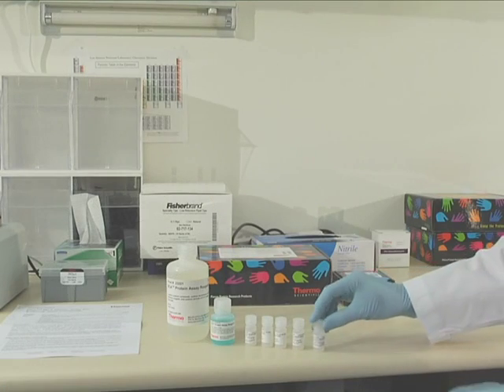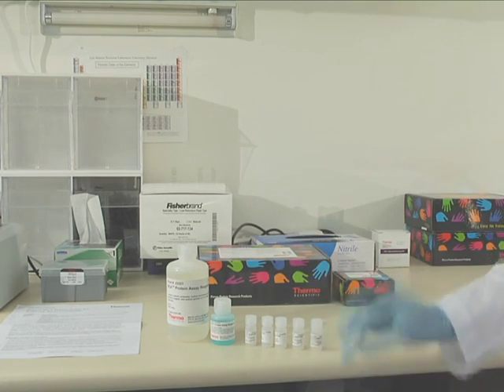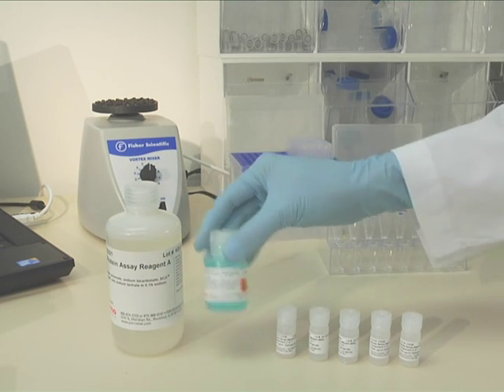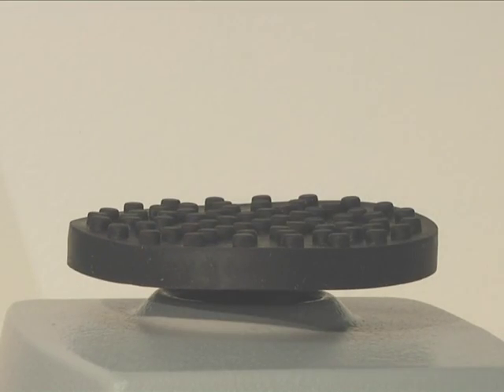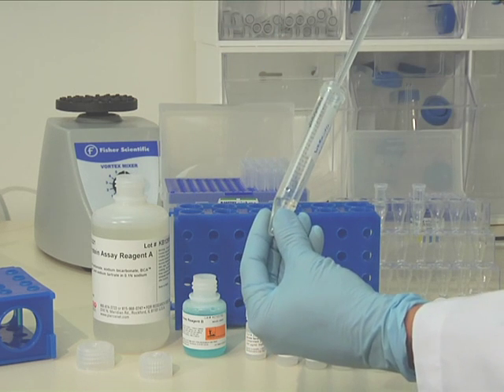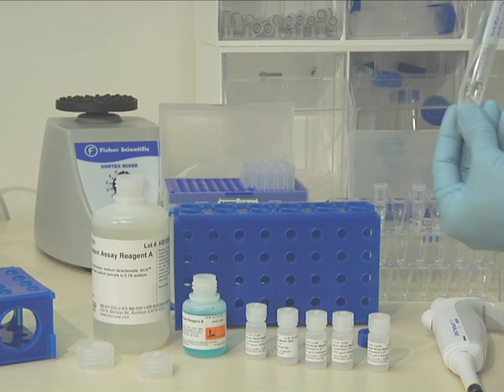To prepare the reagents, first equilibrate all unknown proteins and protein standards to room temperature and mix thoroughly by gentle vortexing. Use a mid-level RPM to avoid introducing microbubbles into the fluid, since bubbles may negatively affect the readings. Prepare enough fresh working reagent for the standards and samples to be measured, using a 50 to 1 ratio of Reagent A to B.